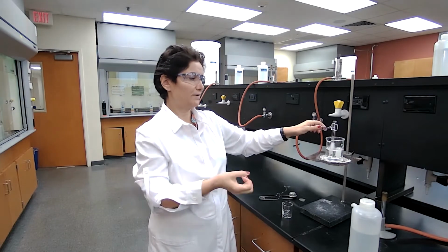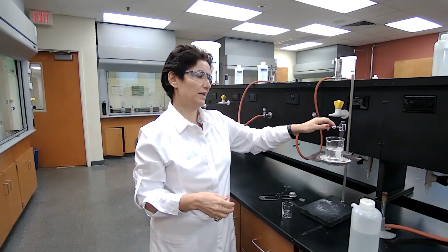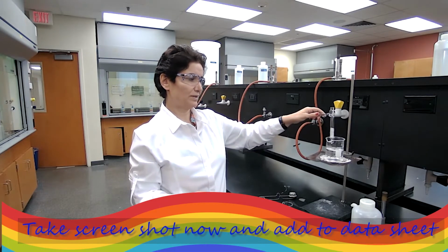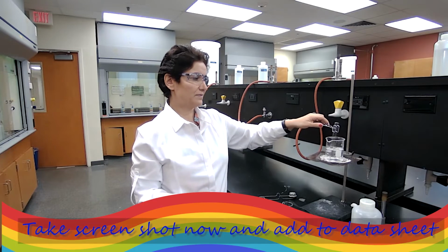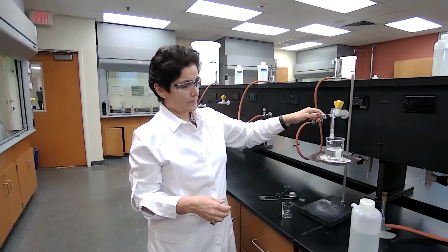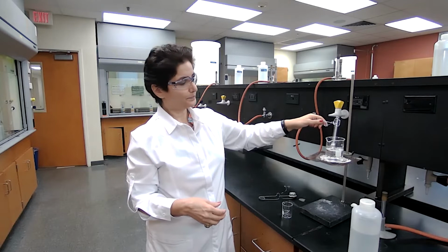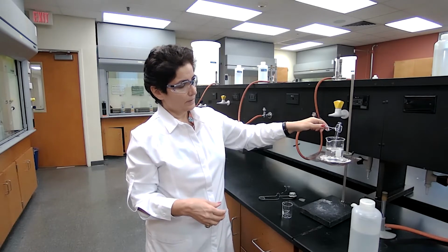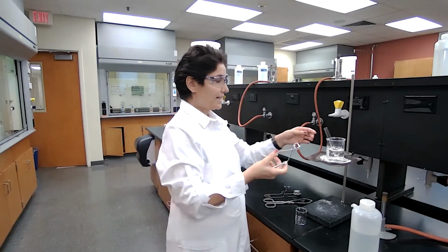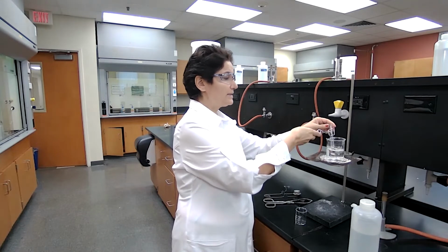If it's boiling, of course, the methanol is going to boil. So I'm carefully monitoring this so it doesn't come out of the test tube. It takes a few minutes for the reaction to happen. And based on the procedure, we keep it for 10 minutes. Okay, it has been 10 minutes and the reaction is complete.